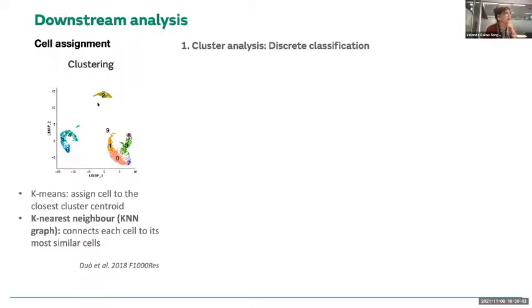And to do this, you can use the k-means cluster. This is unsupervised, so it uses the information from all of your genes or the 2000 features that you have selected, but you do not say anything about, oh, I want this to be one cluster. It's unsupervised.